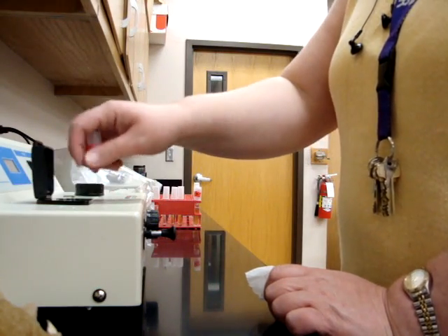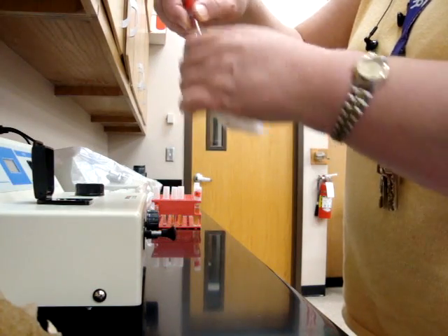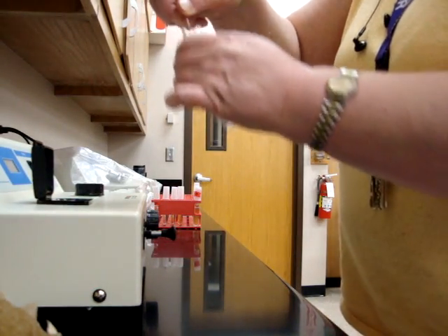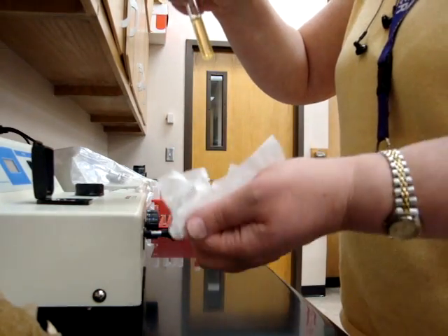If you get scratches on these tubes, that'll make it so you can't read it like it needs to be read. So you want to make sure you don't scratch it — use the lens tissue.